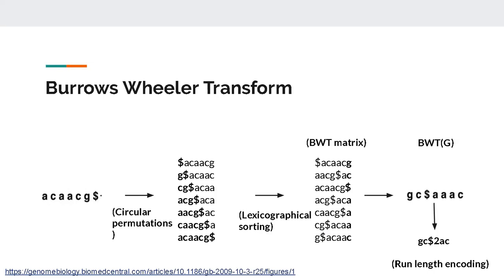I have one query. When reads are quite long, will this lexicographic sorting not take time and memory compared to binary sorting or number sorting?